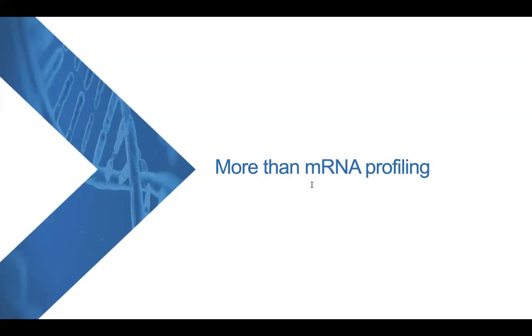Another question is that long non-coding RNAs also have poly-A. So how do you make sure it's the pure mRNA we are dealing with? It doesn't have to be pure mRNA. Everything that has poly-A gets attached to our barcoding beads. It's not an issue. Everything that is polyadenylated gets attached.